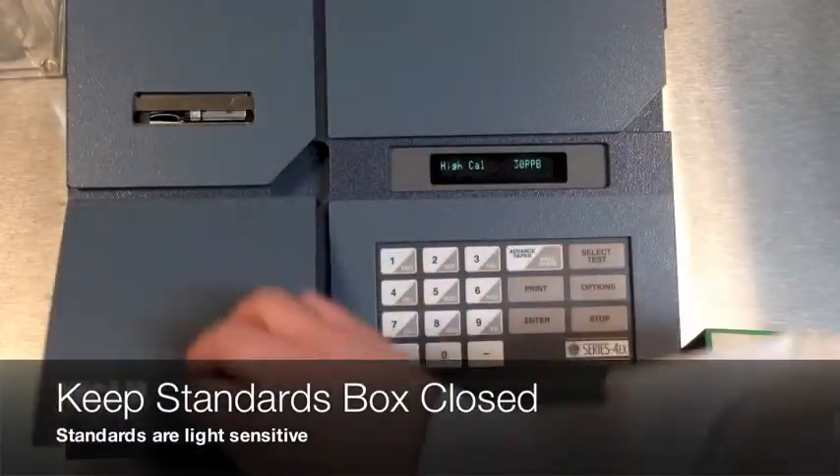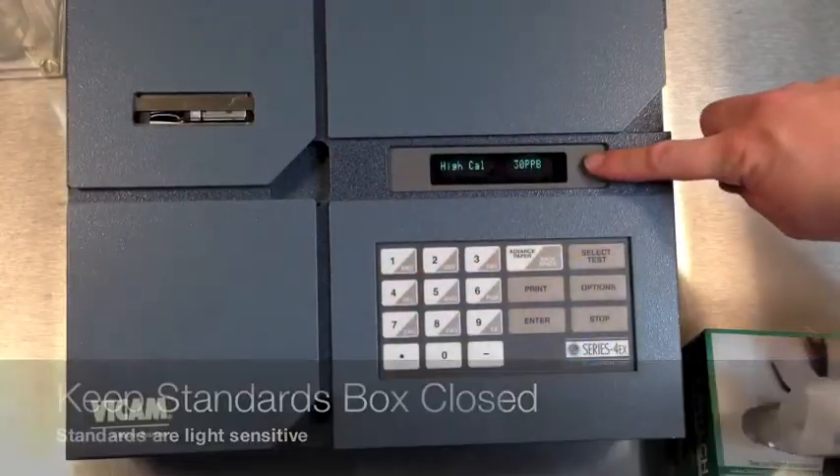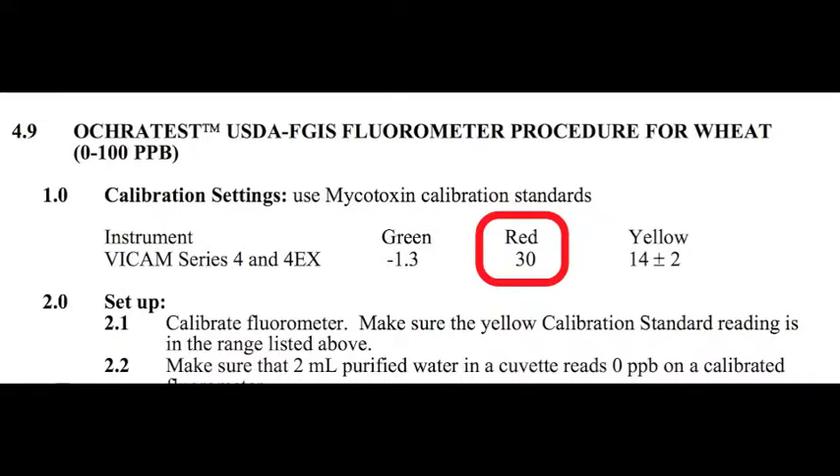The screen will then show the current calibration settings. Use the calibration setting from the current procedures manual, then press Enter.